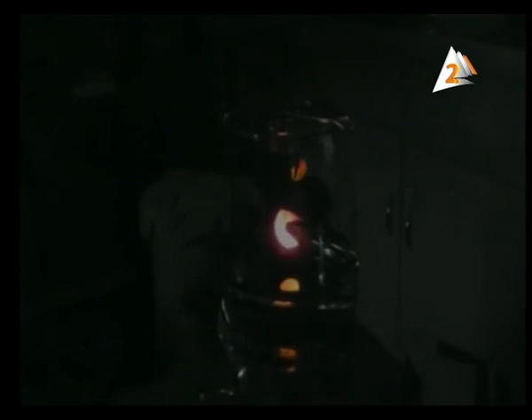Good. Look at this. Even when there is no heating, the reaction stays. It means the copper is a catalyst here. The reaction stays although there is no heating. The amount of the light of the copper increases. Tell me, is the catalyst important? Do you think so? Yes. It is important for what? The reaction will be faster.